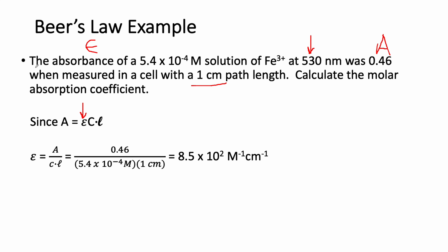So Beer's law gets used all the time when you're doing quantitative work, especially in the UV-VIS. It's great, right? What could be simpler? Well, a little bit simpler maybe. The words could have been a little simpler. And if this wasn't a logarithmic number, that would be simpler. But anyway, it happens to be the log of the transmittance.